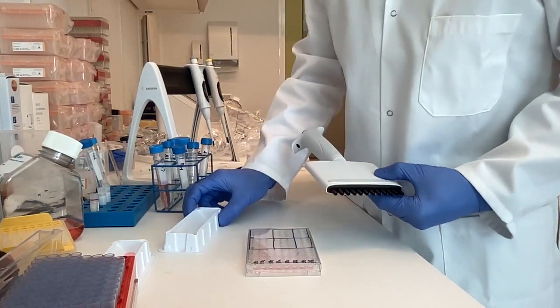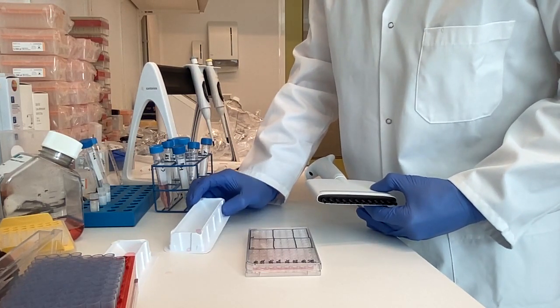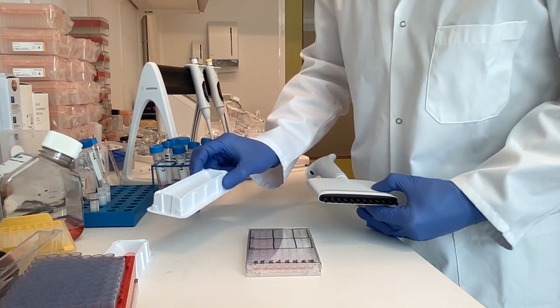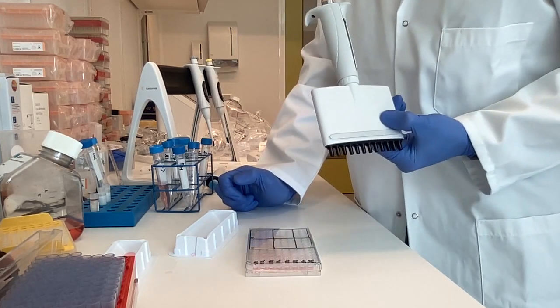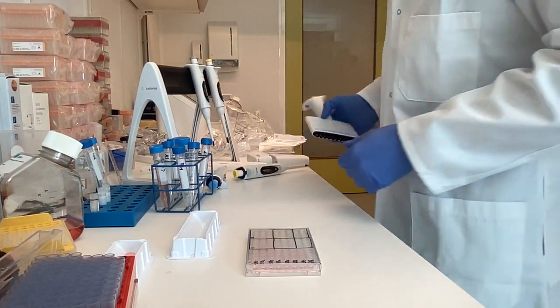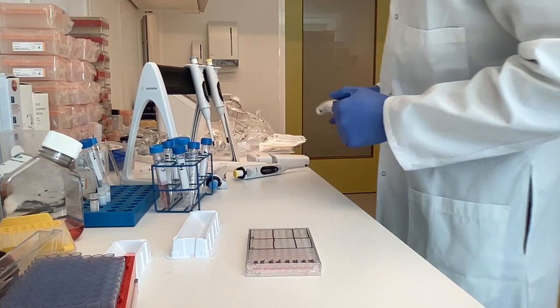In this case we only prepared 1 milliliter of product samples, and it's sometimes difficult, if you have larger containers, to get it out with a multi-channel. So you can also decide to make 2 milliliters to have an excess, or use a single-channel pipette.